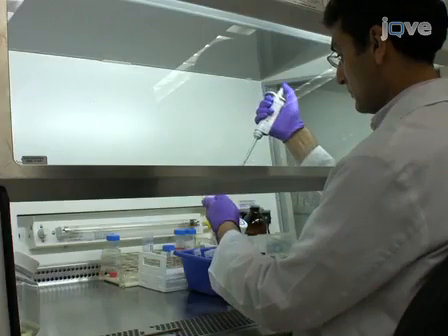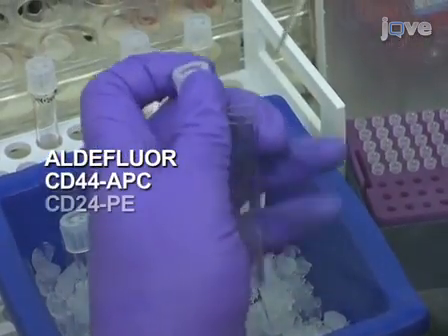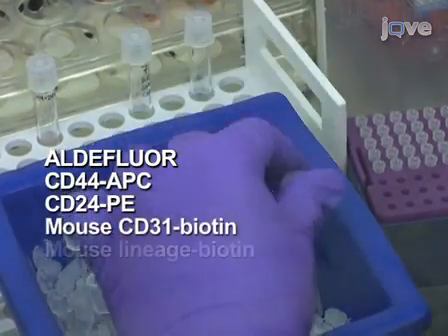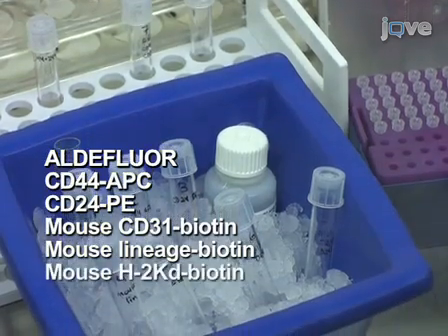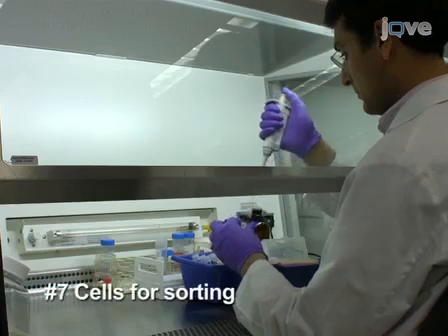Then, in the final tube, stain cells with Aldefluor, CD44 APC, CD24 PE, mouse CD31 biotin, mouse lineage biotin, mouse H2Kd biotin, and streptavidin PerCP. This is the actual specimen to be sorted.